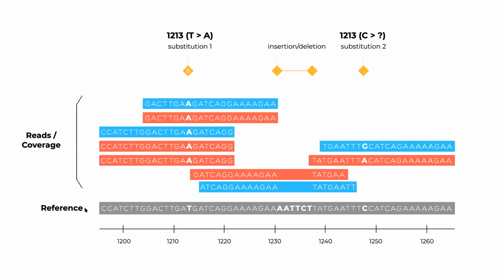Here we have the reference genome, and that reference genome is used as a way to align the short reads to that reference. In some cases, like this position, we find a type of a change. That change is one nucleotide letter changing to another nucleotide letter, right?